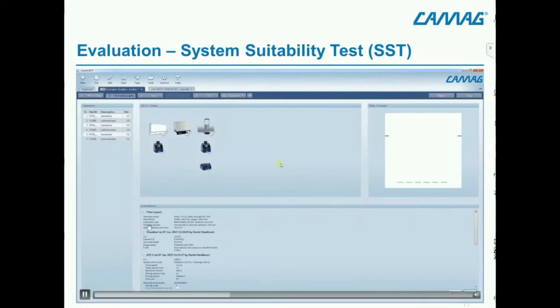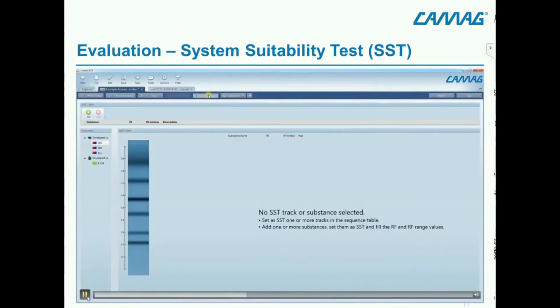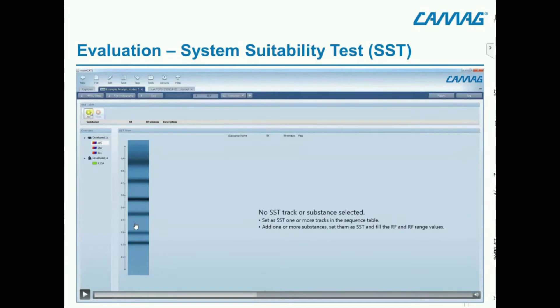Then we click on the tab 'SST'. Here you see the different detection modes — this was not only captured at UV 254nm; we did a multi-wavelength scan. What you see here is the selected track for the SST recorded at 205 nanometers.